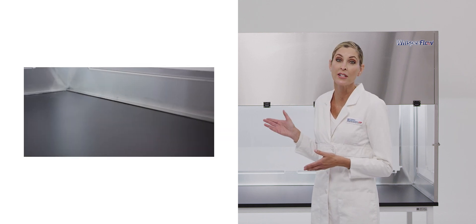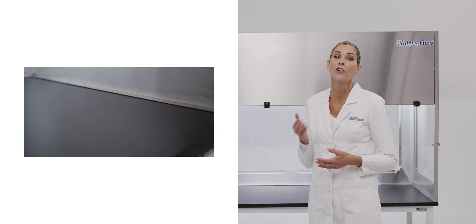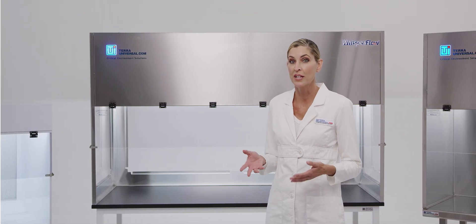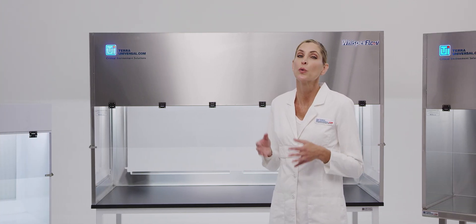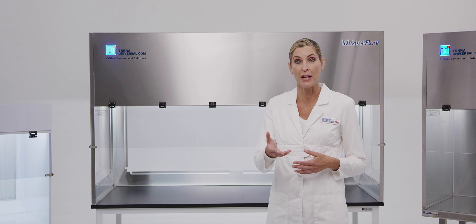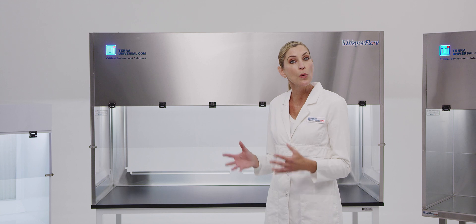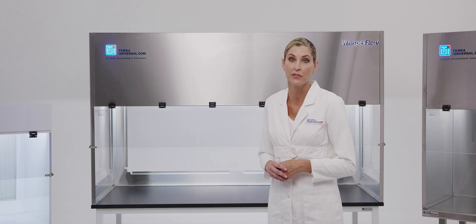This hood is installed on Tara's epoxy resin workstation for use in biochemistry research and drug development. The one-inch thick epoxy resin surface resists corrosion, prevents bacterial growth, deflects heat up to 325 degrees Fahrenheit, and supports weight loads of up to 2,000 pounds.